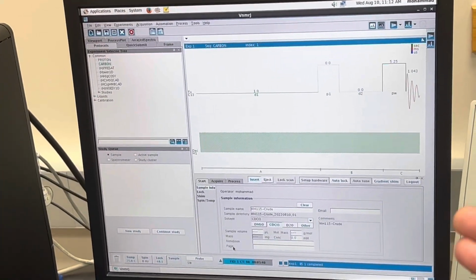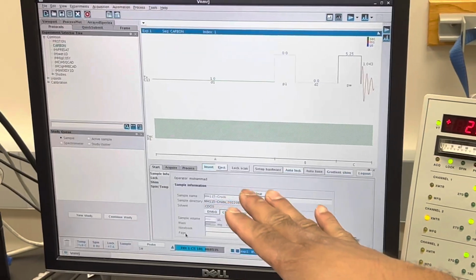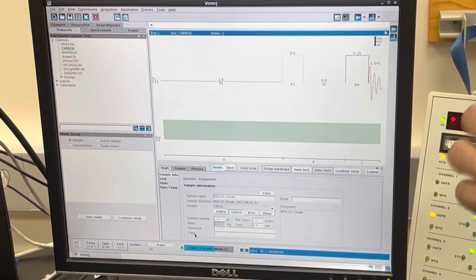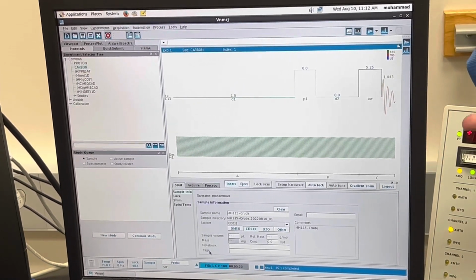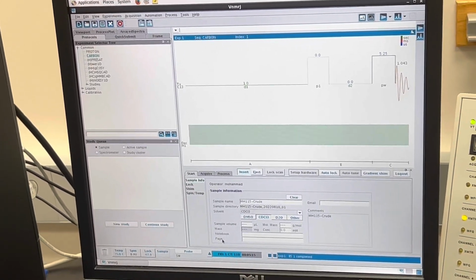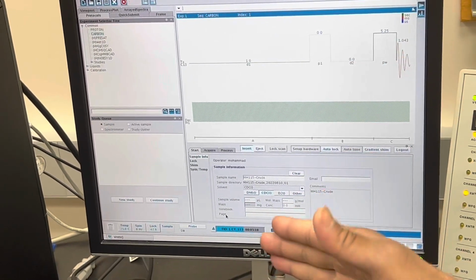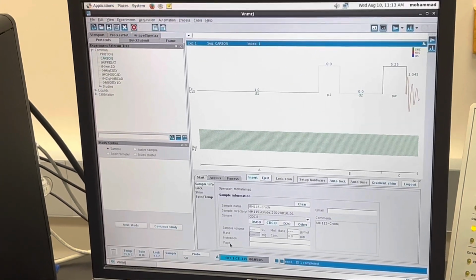But suppose you don't do it that way, and you run the carbon directly with the sample submit queue. You leave it for 10 minutes or so, come back, and see that your sample was not good, the shimming or locking failed, and your experiment stopped. So it is ultimately lost. That's why he always recommends running the proton NMR before the carbon, by making a queue. Once that is successful, just drag the carbon and do the experiment. Is it clear? So always do the proton first.